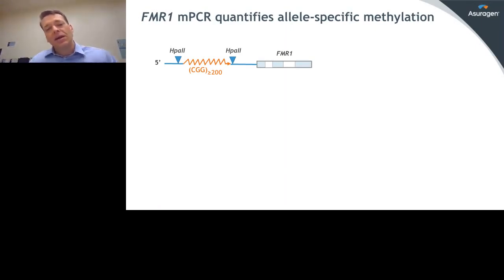The assay can give you really subtle differences in signal intensity that can be very informative in a number of different ways. And for those to be fully tapped into, you have to have a high-resolution platform like this type of instrument.